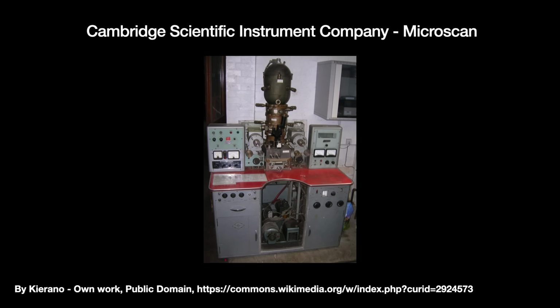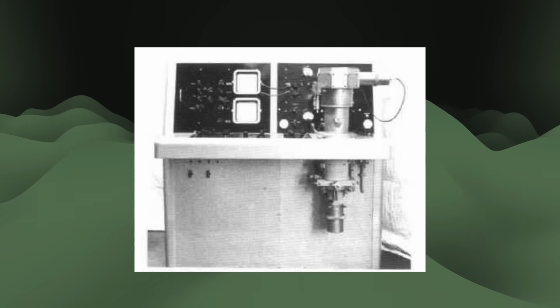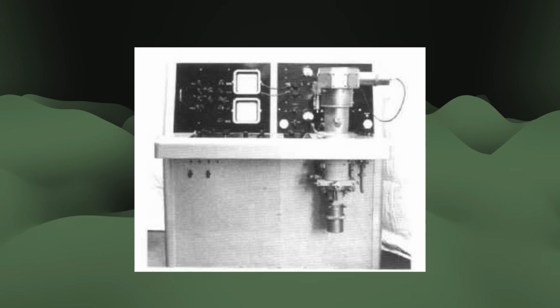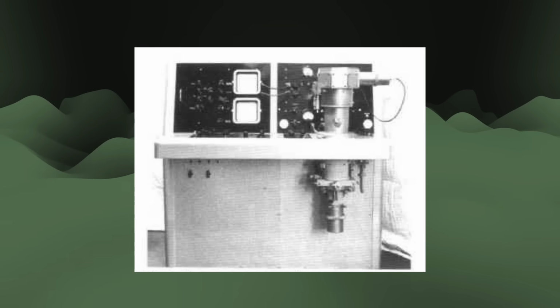The Microscan sold well. It did something no other instrument can do, and that finally convinced Cambridge to take a chance on Oatley's scanning microscope idea. In 1962, DuPont's Canada team saw a prototype of what was called the Stereoscan SEM at the Institute of Physics and Physical Society exhibition, and having used the SEM previously built for the Canadian Pulp and Paper Institute, they put in a solid order for the first production machine.